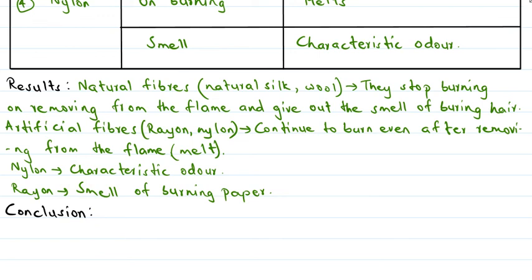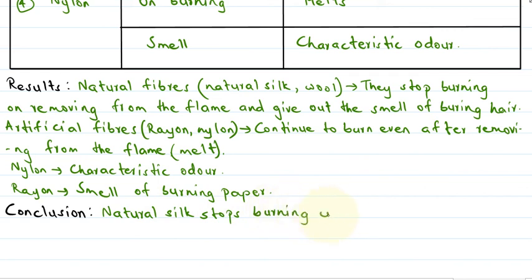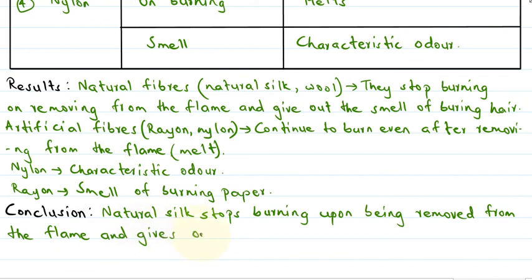We can conclude that natural silk stops burning upon being removed from the flame, and it gives out the smell of burning hair.